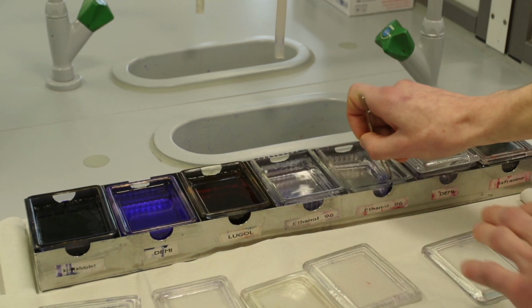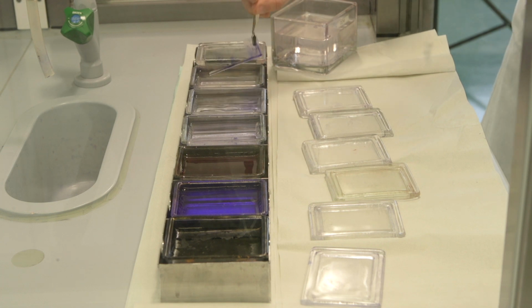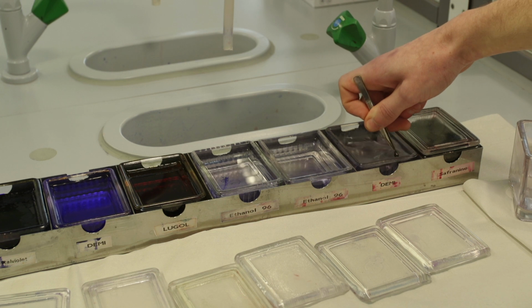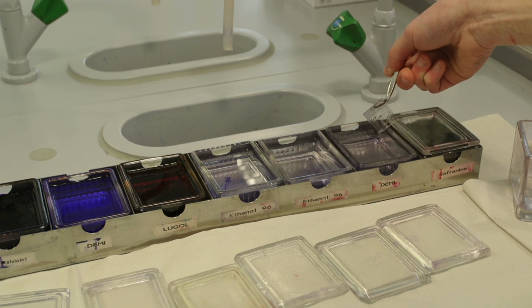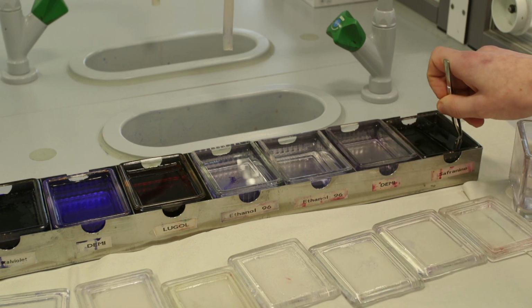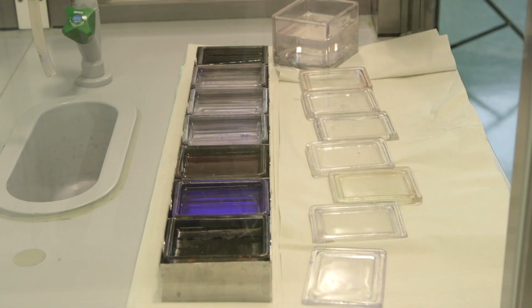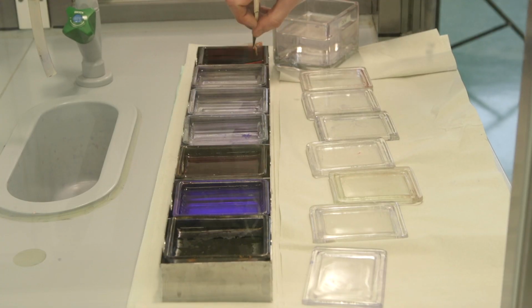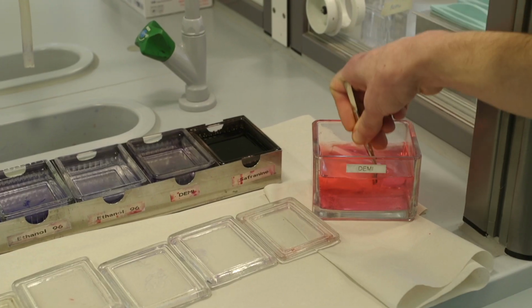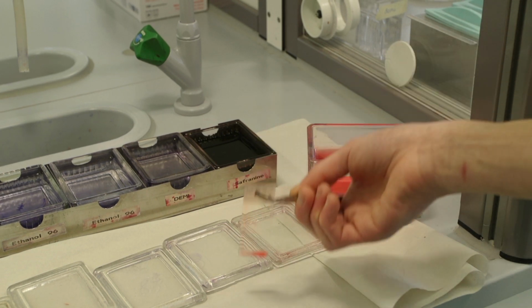Now place the slide in the second container with 96% alcohol for 1 minute. Wash the slide well in demi-water and let the excess water drip off. Again, you can refresh the demi-water if necessary. Now place the slide in the safranin for 1 minute. Wash the slide well in the demi-water and let the excess stain wash off the slide by holding the slide vertically and dry the back of the slide. Dry the slide at room temperature or on a slide dryer.